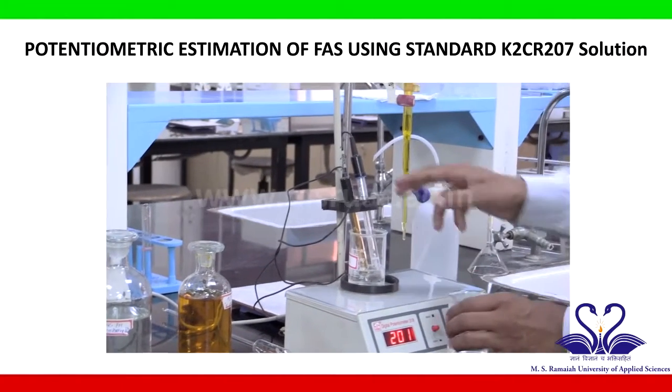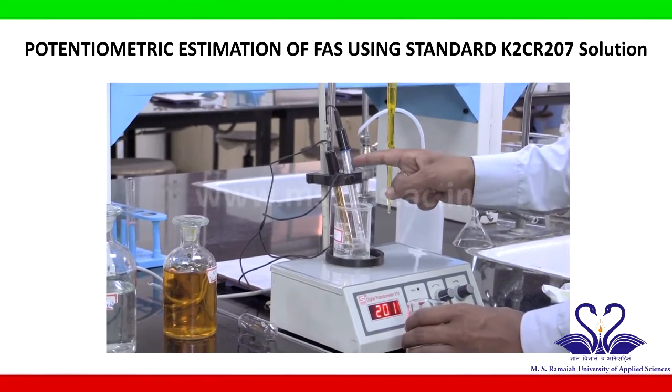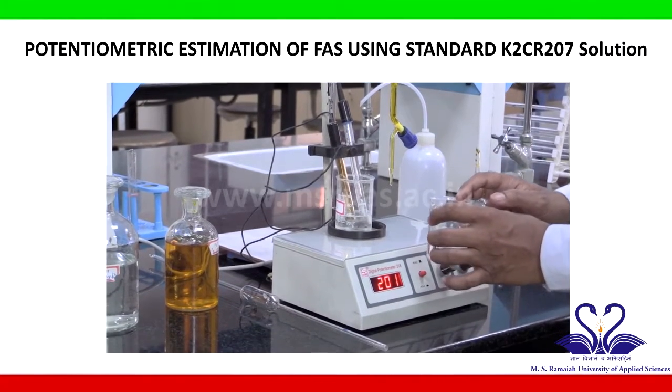Now we have to place the platinum and calomel electrode assembly into the solution.